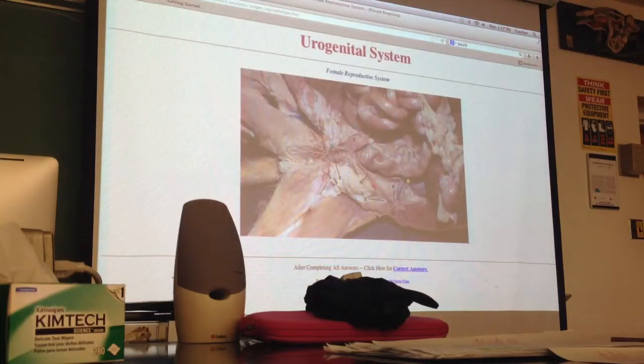View and actually show you the bladder first. So in this view, you can see the bladder is going to be, basically if you follow the large intestine down, that'll dead end kind of near the bladder. Okay, so you'll find the bladder right at the end of the large intestine, and you'll see it in two different views. So note that the bladder in your cat may not look like this.